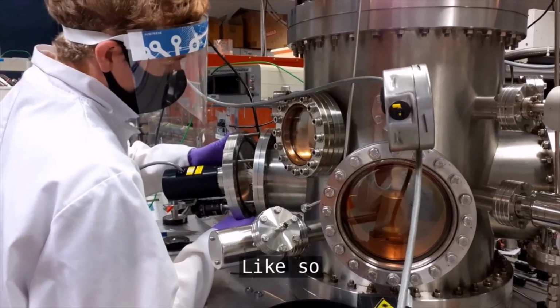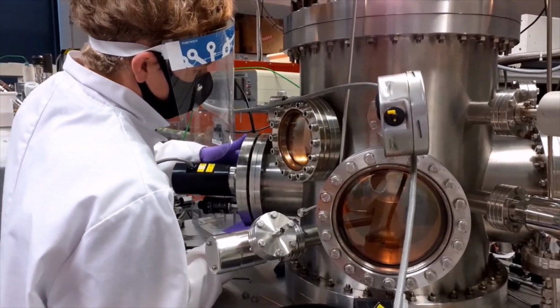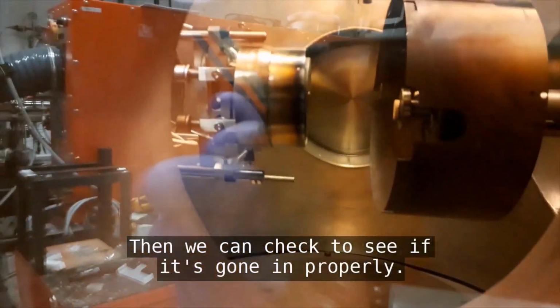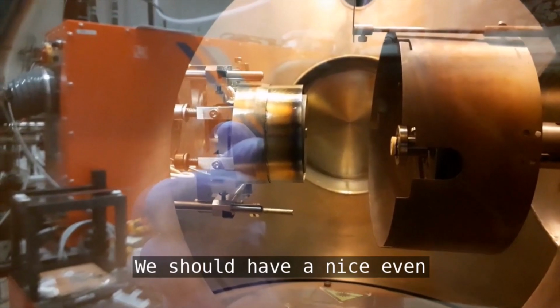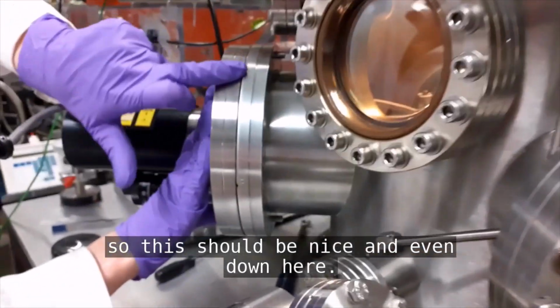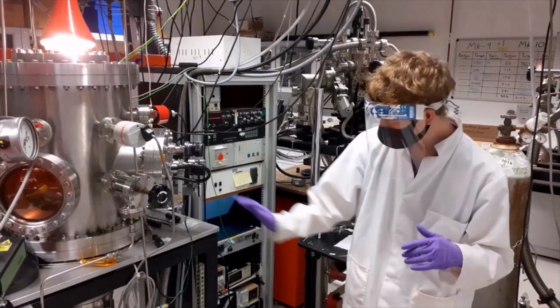Like so. And then we can check to see if it's gone in properly. We should have a nice even gap down the edge here. So it should be nice and even down here. And I think that's okay there.